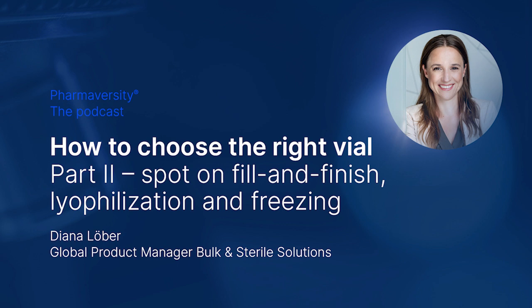But of course, if you do this in nested configurations, the packaging density in the freeze dryer might then be lower. But as compensation, usually the cycle can also be done faster. But one thing that can happen, no matter if bulk or nested, is a phenomenon called fogging. Meaning you have this fog-like appearance just above the drug product, which is the lyo cake. And this is a very nasty topic because it occurs very erratically, sometimes even years after the process has been developed and proven stable. And vials that show fogging usually need to be rejected, leading to elevated production costs.